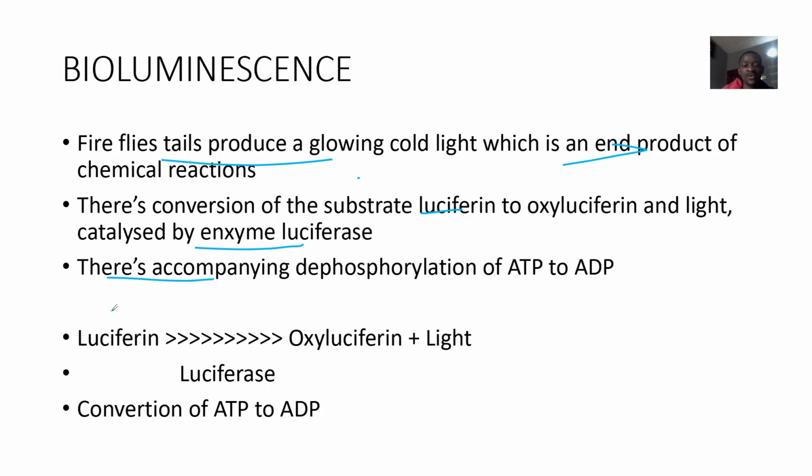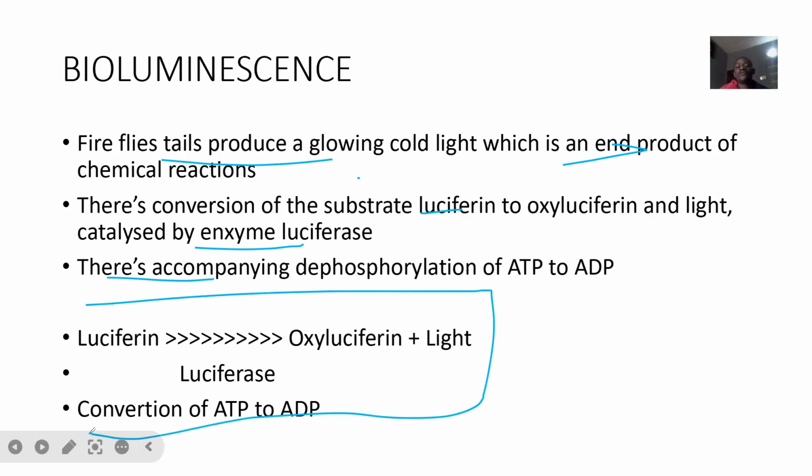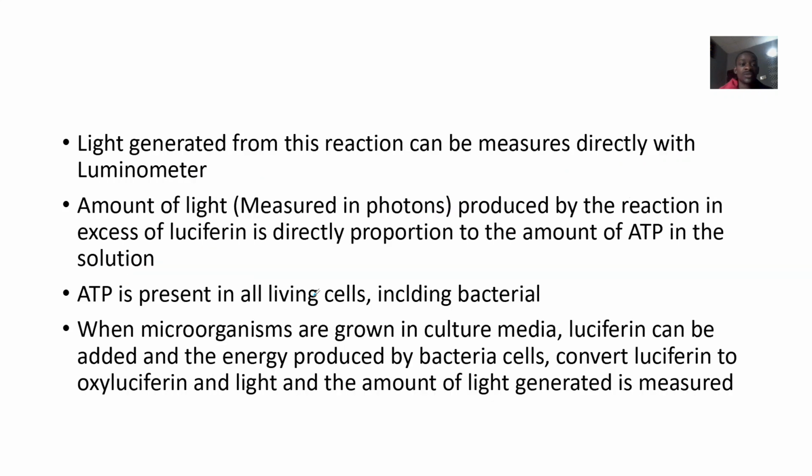So you just write the equation down here so that you make the lecturer happy. Luciferin is converted to oxyluciferin and light, catalyzed by luciferase. ATP will be converted to ADP, so you write ATP here and ADP here, the way they do it in biochemistry. The light generated from this reaction can be measured directly using a luminometer.